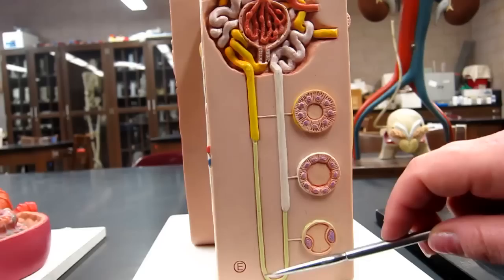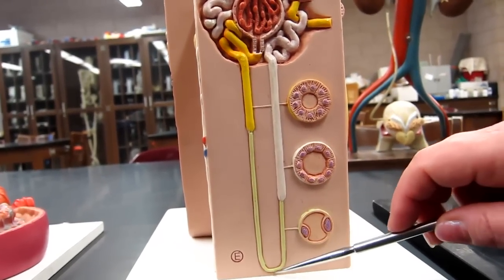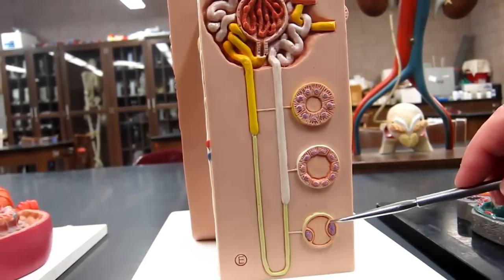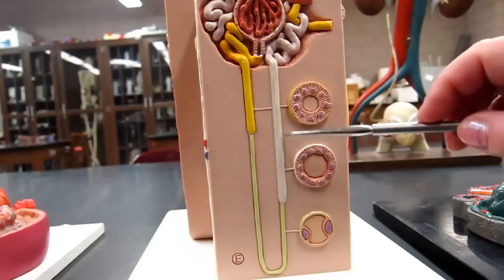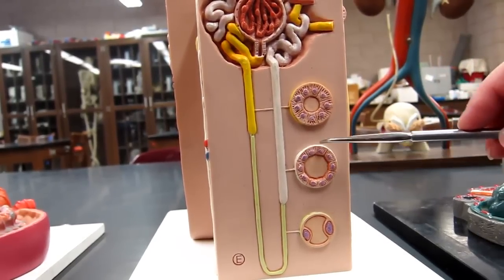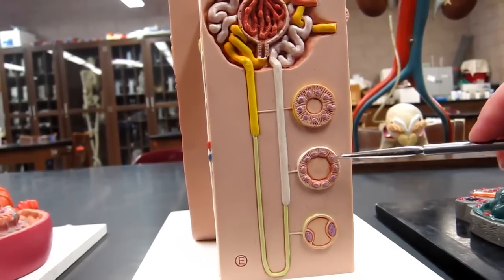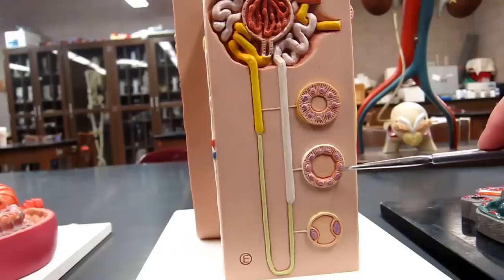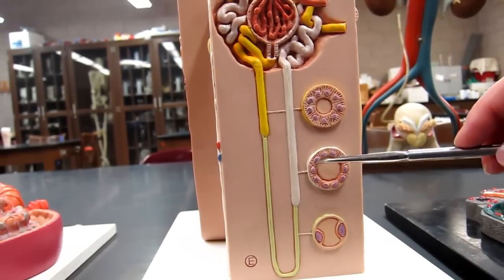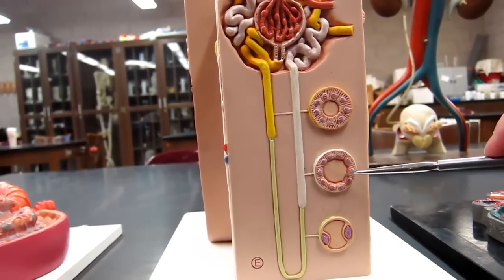Here's the thin segment of the loop of Henle with its simple squamous epithelium. Okay, and then for the distal convoluted tubule and the ascending or thicker portion of the loop of Henle, you can see we have simple cuboidal epithelium with fewer microvilli. And it really doesn't look like much as far as microvilli there at all.